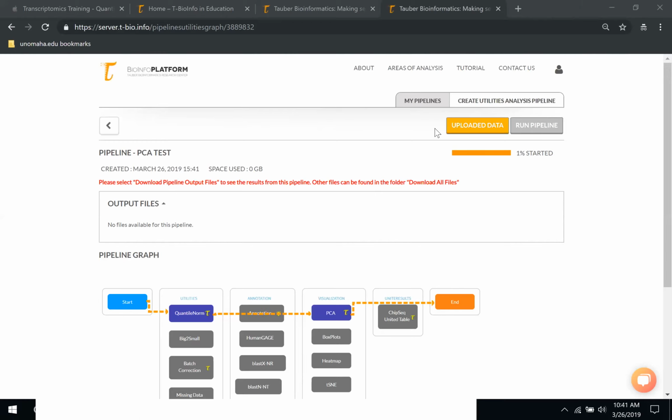And just to verify whether you have expression or not, that is why you do the PCA, because PCA gives you a pictorial representation of these samples in a 2D plot. I hope this answers the question. It would be a very rare case that you're doing a study and there is not at all any expression in the data. There would be something, it might be low.